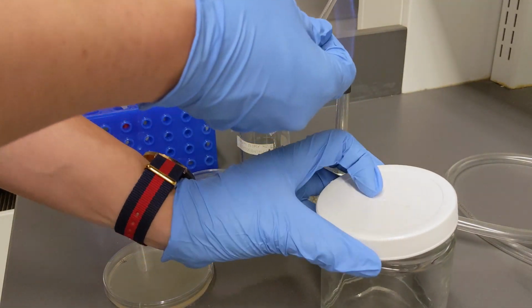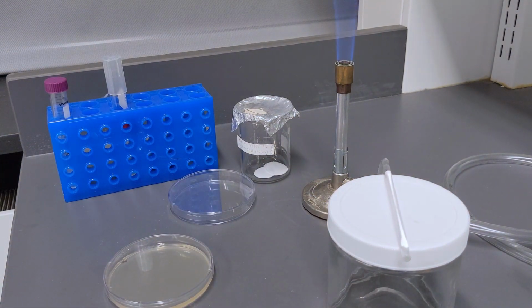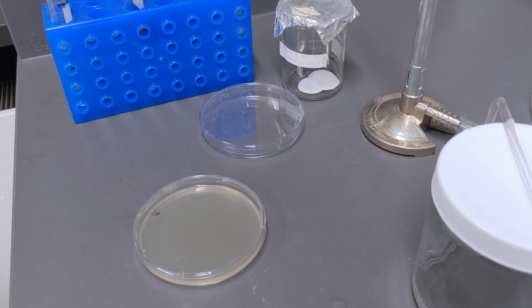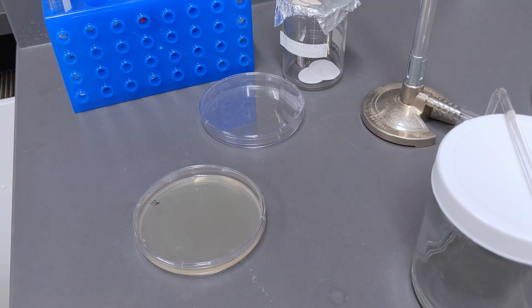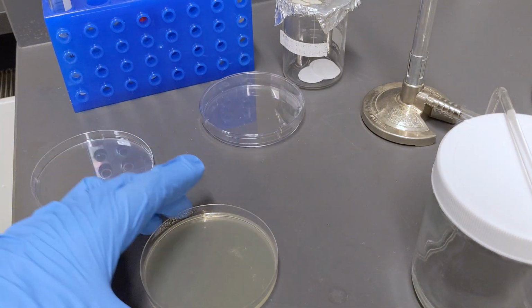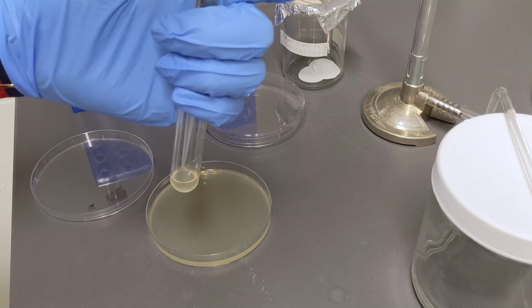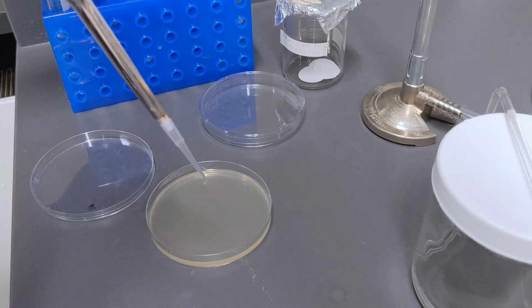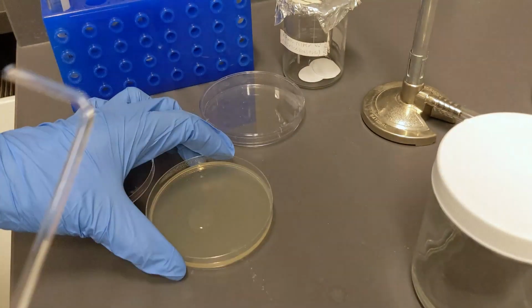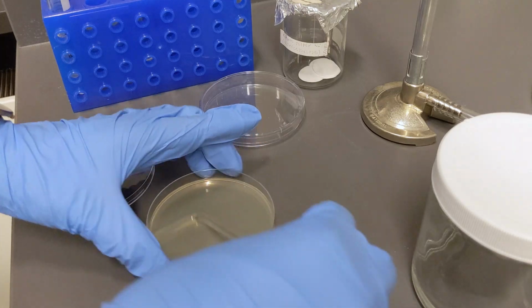We will use a hockey stick to spread S. aureus culture on an agar plate. First, we use ethanol and flame to sterilize the hockey stick. Then, we add the S. aureus onto the agar plate. Then we use the clean hockey stick to spread it.